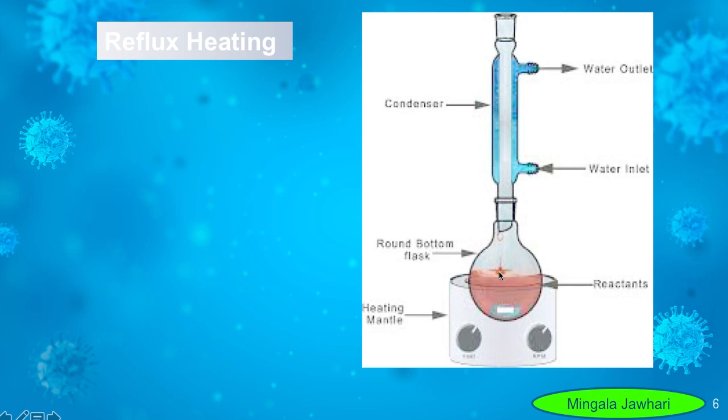So if we start heating the mixture, some of the alcohol, carboxylic acid or ester starts to evaporate or escape from this mixture, moving where? Moving in this inner tube. When they reach this part, the water coming from outside, which is cold tap water, cools the mixture, it condenses the vapors back to the reaction mixture so that none of the components will be lost. The gases will never reach the top. They cannot reach the top because this part is cooler than this part.